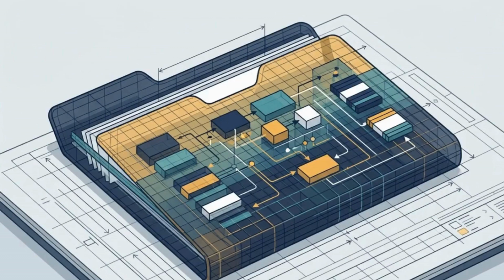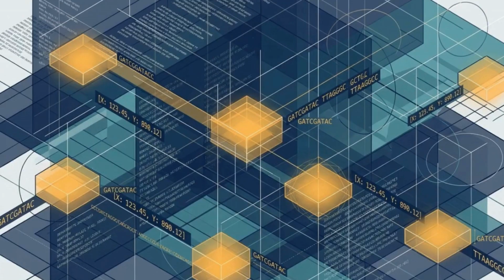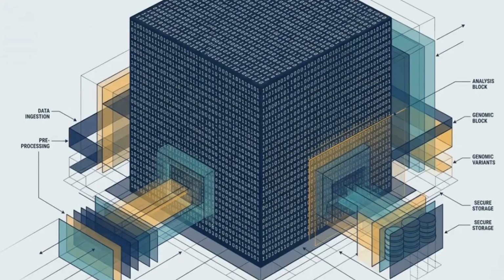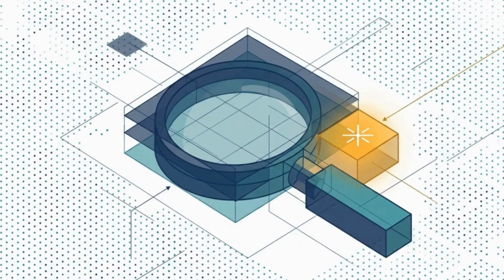The results of this mapping are stored in a SAM file, a human-readable text document that records the exact chromosomal coordinates where each read finally snapped into place. However, human-readable text takes up too much space. To process massive datasets, the computer compresses the SAM into its binary twin, the BAM file, which works alongside an index file so the machine can instantly search millions of coordinates.